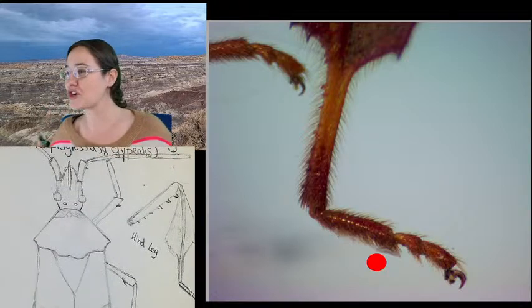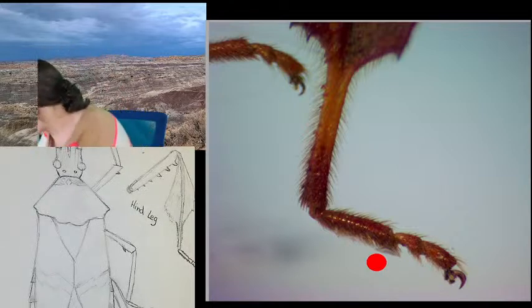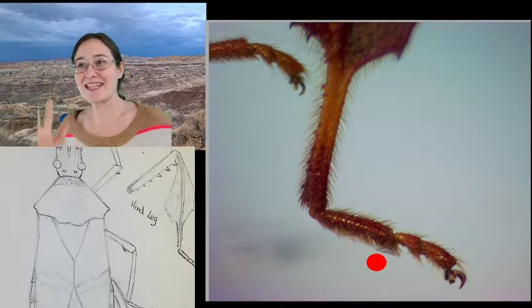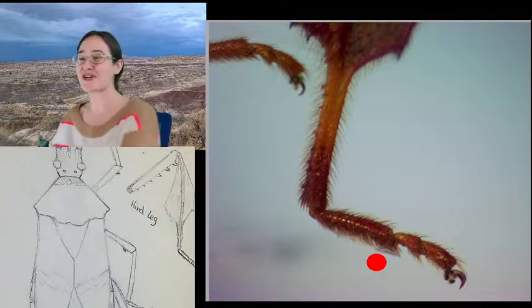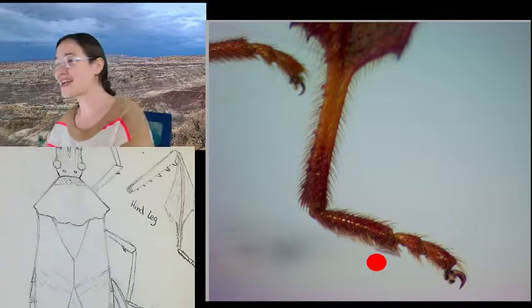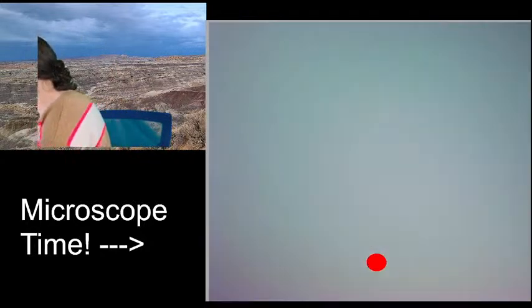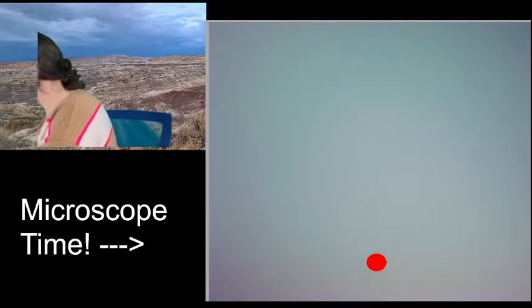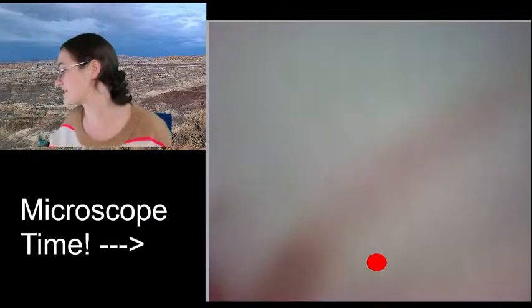And I'm going to show you, Marley. So you asked about whether he's kind of bad tasting. It's been a minute since I have identified these guys and looked at this one under a microscope, which is kind of why I chose it. I wanted to stretch a little bit and just play with a new friend. And I believe that this specimen, we're going to have to check. Oh, don't drop them. Oh, this specimen was collected in Arapahoe County, Colorado, if anyone is interested.